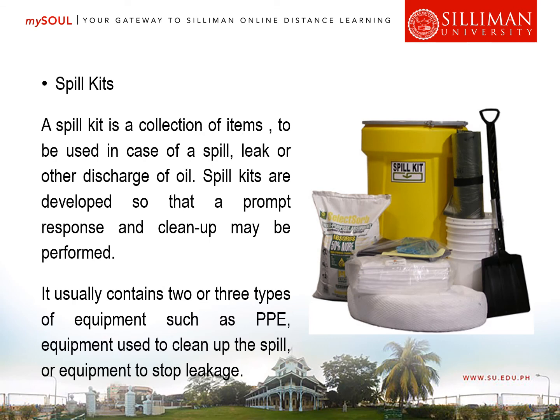Then we have our spill kits. A spill kit is a collection of items to be used in case of a spill, leak, or other discharge of oil. They are developed so that a prompt response and cleanup may be performed. So every person working in the laboratory should be trained or have an idea on how to handle spills inside the laboratory.